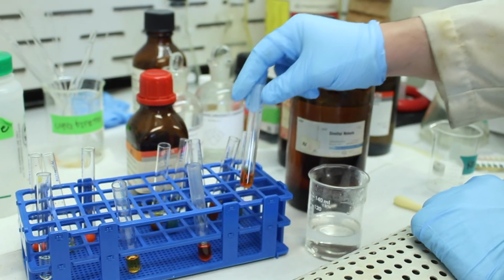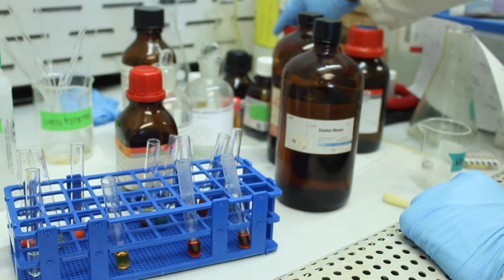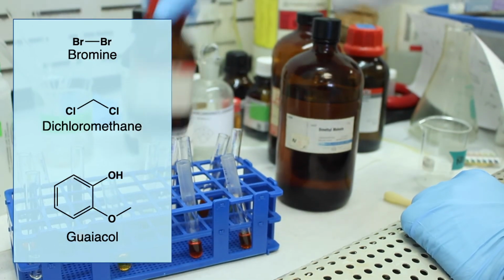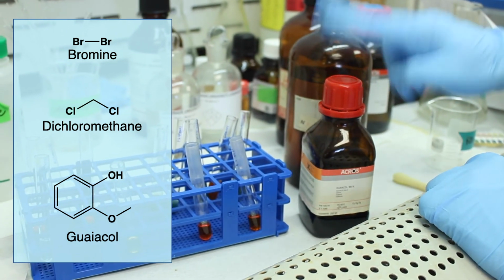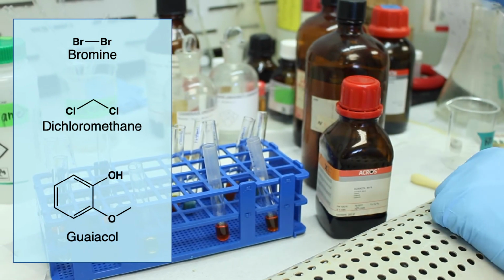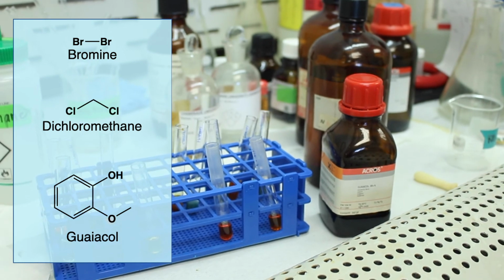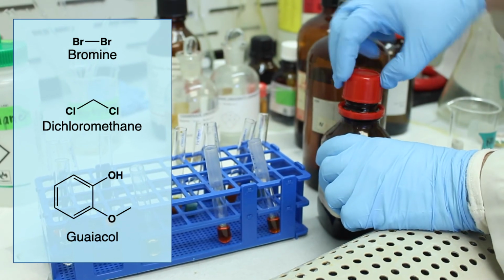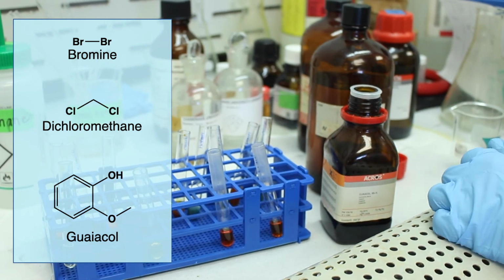The final test is going to be an EAS reaction. So we're going to take guaiacol. Where is it? Here we go, guaiacol. Guaiacol is 2-methoxyphenol. That is, by the way, the standard framework for all of the vanilloids. So depending on what you place on this ring, you can get vanillin or eugenol, as we discussed in earlier labs. So this one smells nice too. It kind of smells like a cross between vanilla and caramel.